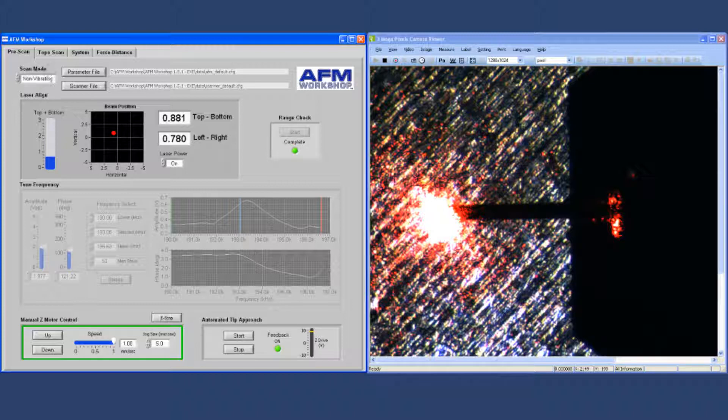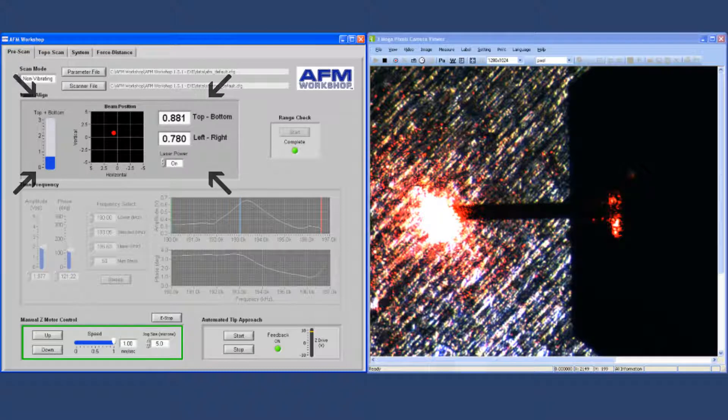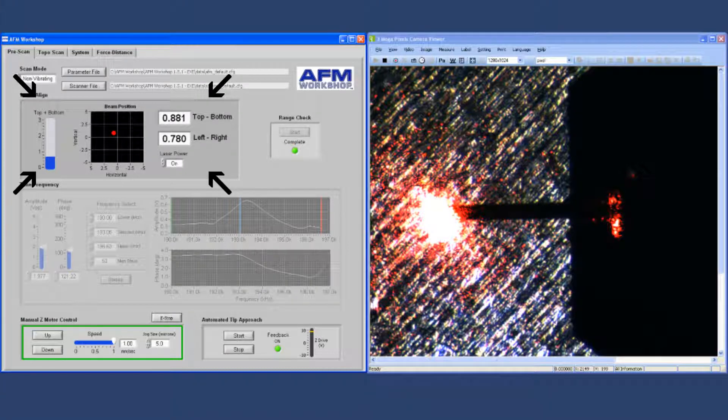Next are the laser alignment capabilities, shown here. There's a red dot alignment, and it shows the position of the beam on the photodetector.